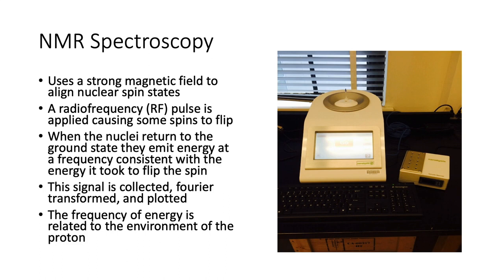This will make a lot more sense when Walt talks about it later. So the important thing to note here is that the frequency of the energy that a proton emits as it changes spin state is related to the environment of the proton.